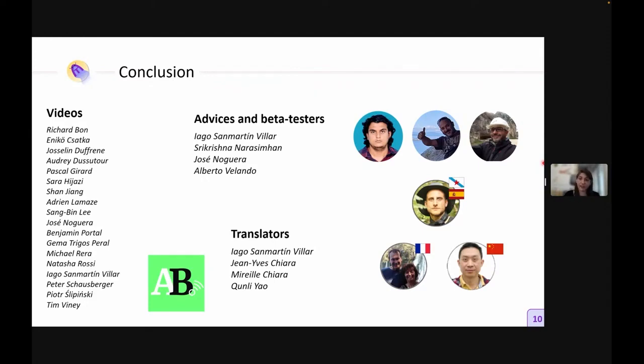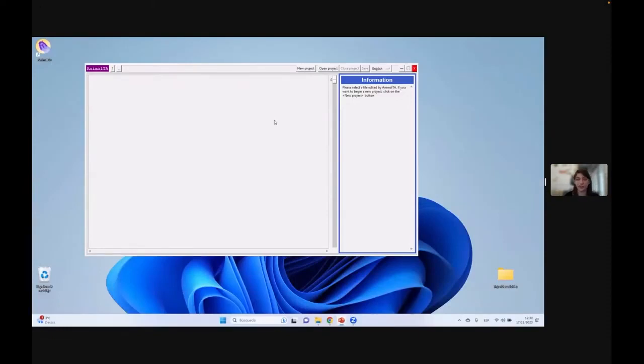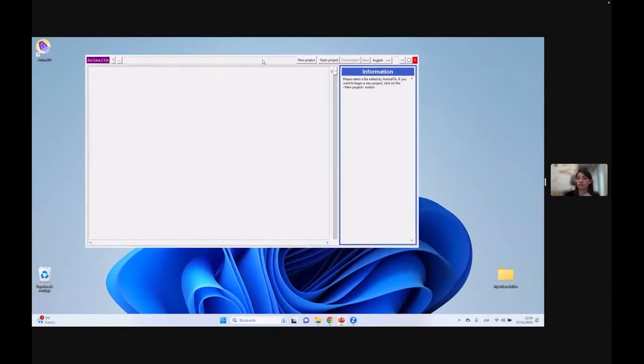And if I have time, I'd like to make a very short demonstration of the program. And I think I have time. The idea is that I cannot explain everything because we don't have time. So we'll just track 5 videos right now and show you how simple and fast this can be.